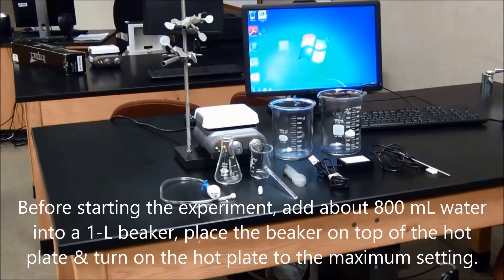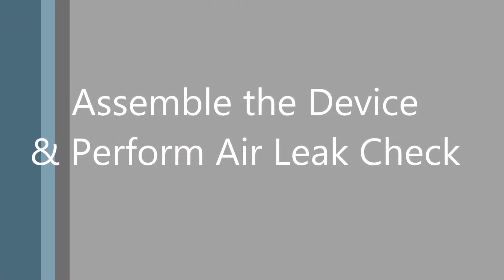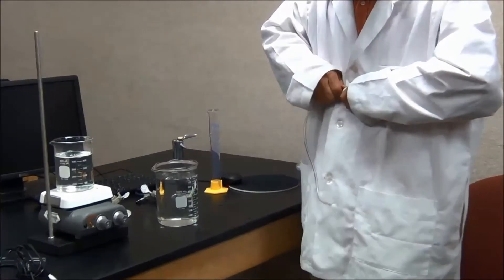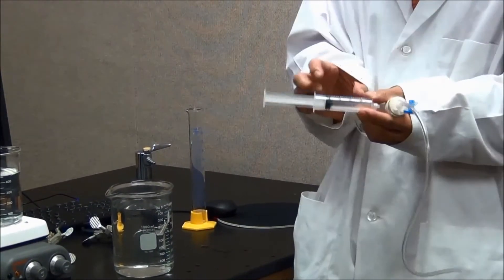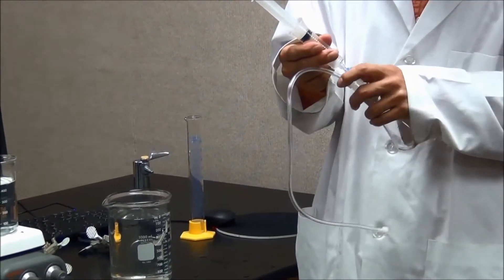This is what we have for this experiment. To assemble the device, you need to seal the 150 ml Erlenmeyer flask with the provided rubber stopper. Then connect the syringe to the rubber stopper. Make sure there is enough air inside the syringe.